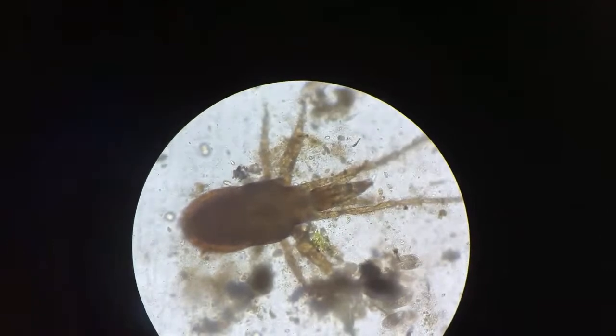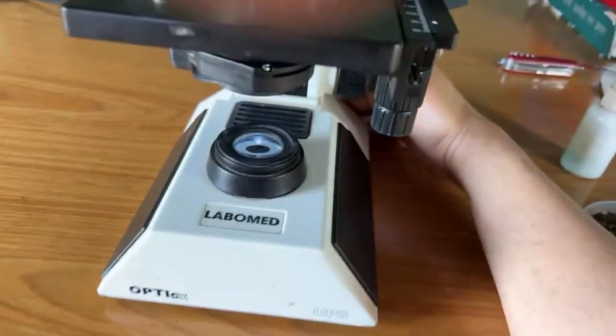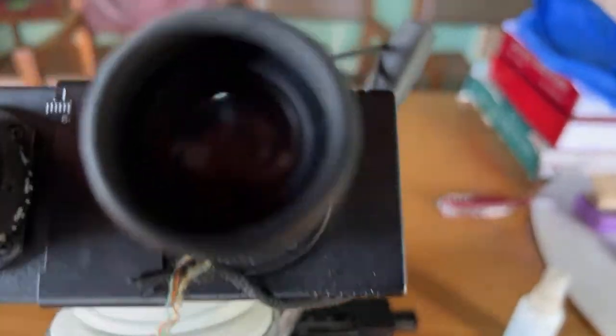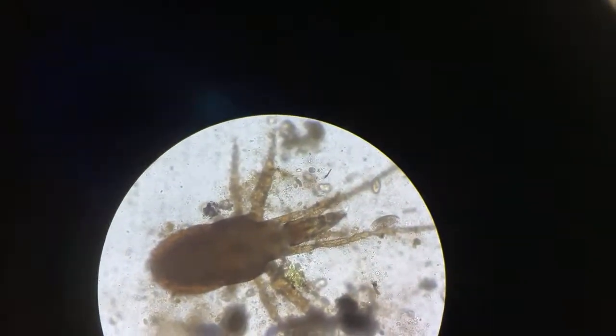It would have been like this. I've switched off the torch, and this light I'll put on, and what we'll see now is the generalized X-ray sort of a view. And okay, let's keep a remembering thought.